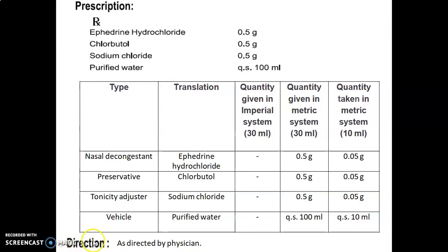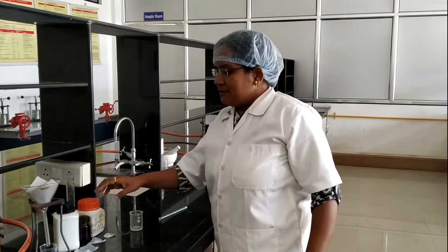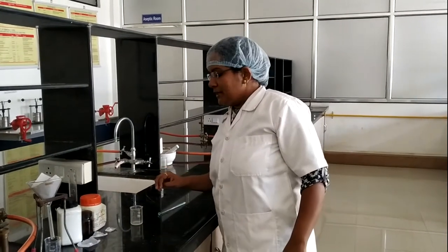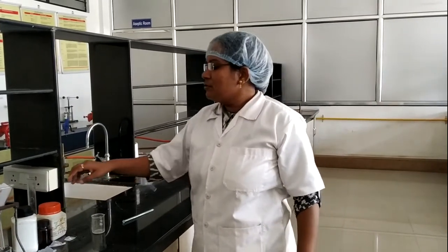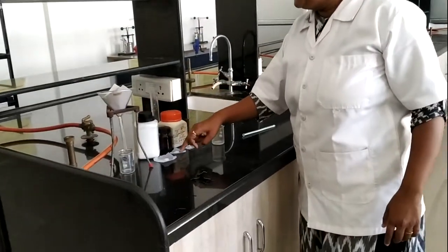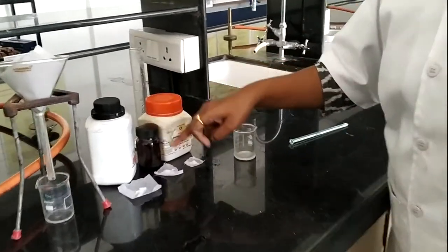Direction: as directed by physician. So for performing actual experiment, let's move towards laboratory. For performing actual experiment in laboratory, we have this ephedrine hydrochloride which is previously weighed.